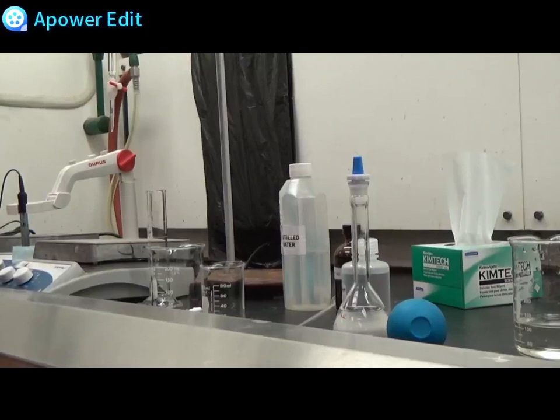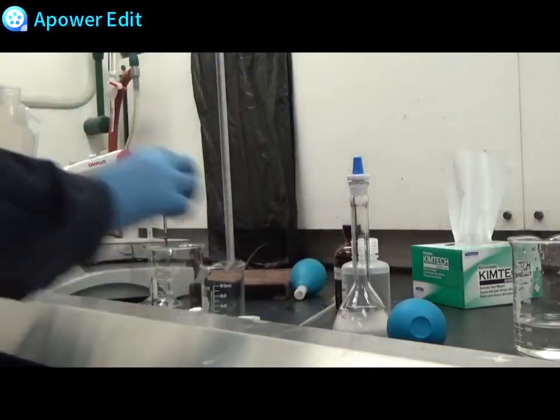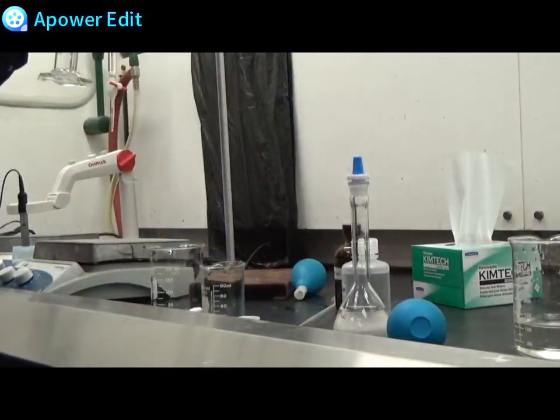I will begin preparing the acidic solution by measuring out 25 ml of distilled water and adding it to the titration beaker.